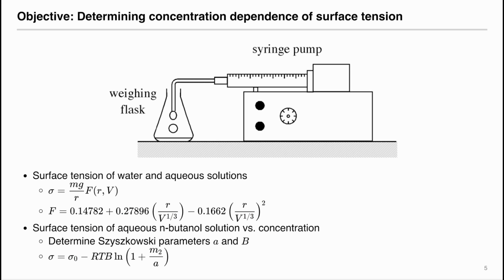After knowing the background equations for this experiment, we can go into each objective and look at how we can perform this experiment. First of all, the experimental setup: we have a syringe pump that is connected to a syringe. In the syringe, we fill a solution of interest whose surface tension we want to determine. At the top, we have a tip with a nozzle that is very delicate. Please do not damage the nozzle. Do not use nozzles that have chips or any fouling on them, because it will affect the surface tension measurement.